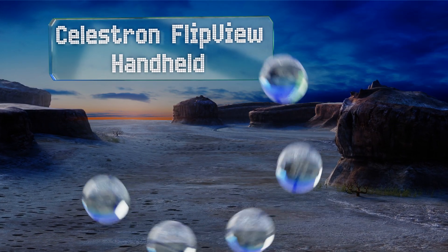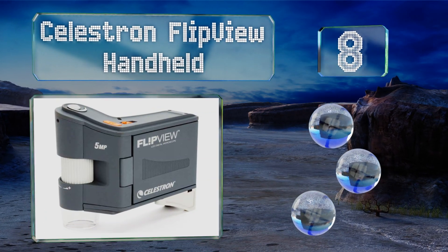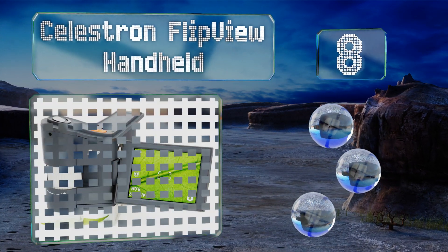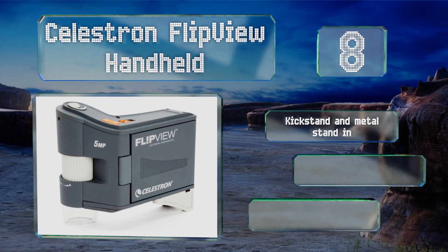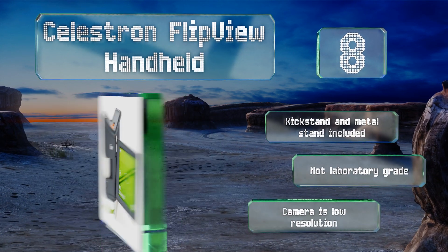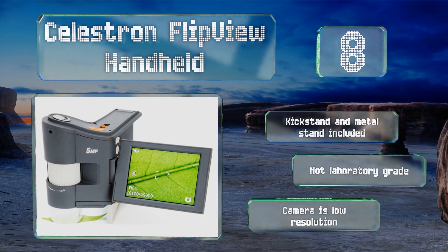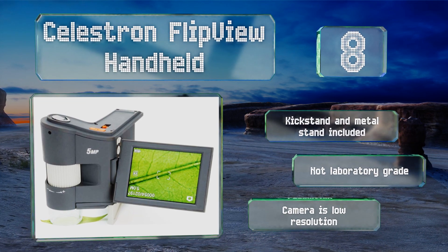Coming in at number eight, the Celestron Flip View Handheld is a lightweight portable option with a three inch screen that opens out and rotates 270 degrees. It can magnify up to 120 times as you capture photos and videos that are easily transferable to a computer. It comes with a kickstand and a metal stand, however it's not laboratory grade and its camera resolution is low.